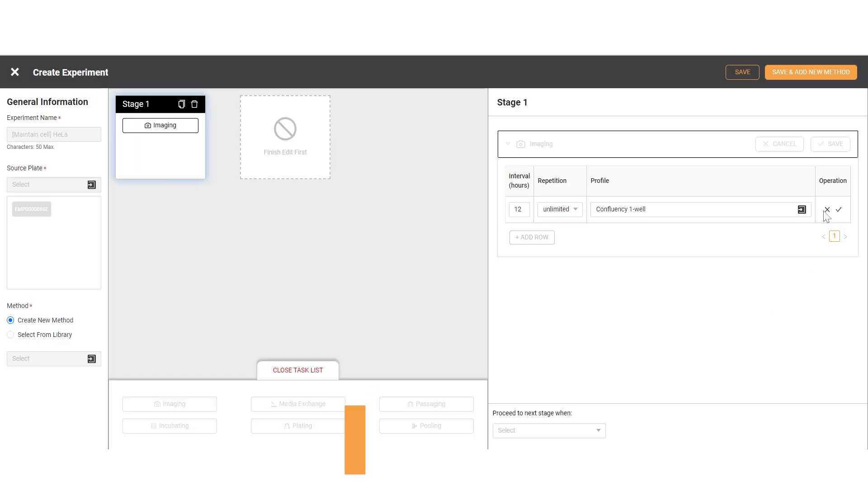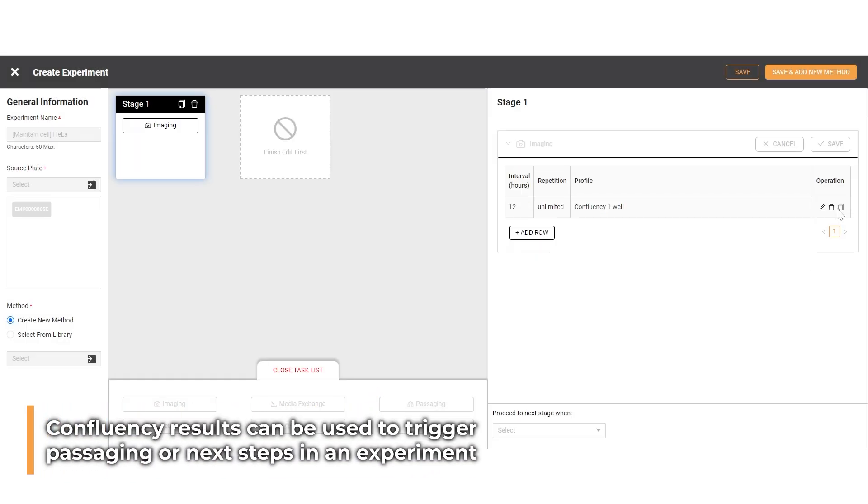The results of this analysis will decide the next action, moving to the next stage or continuing to feed and image your cells.